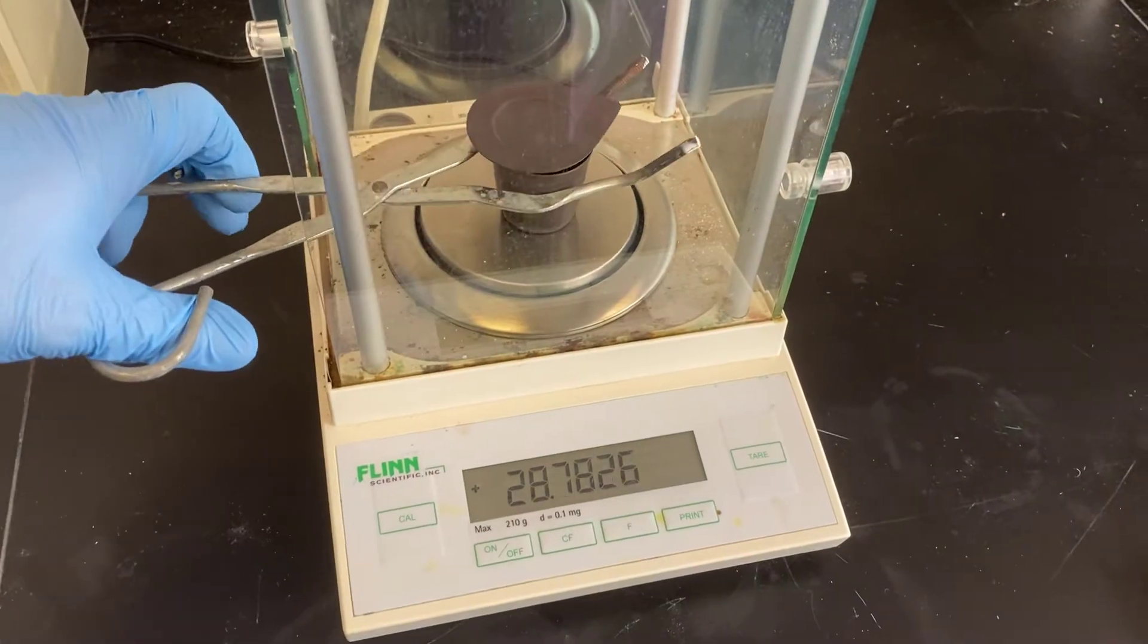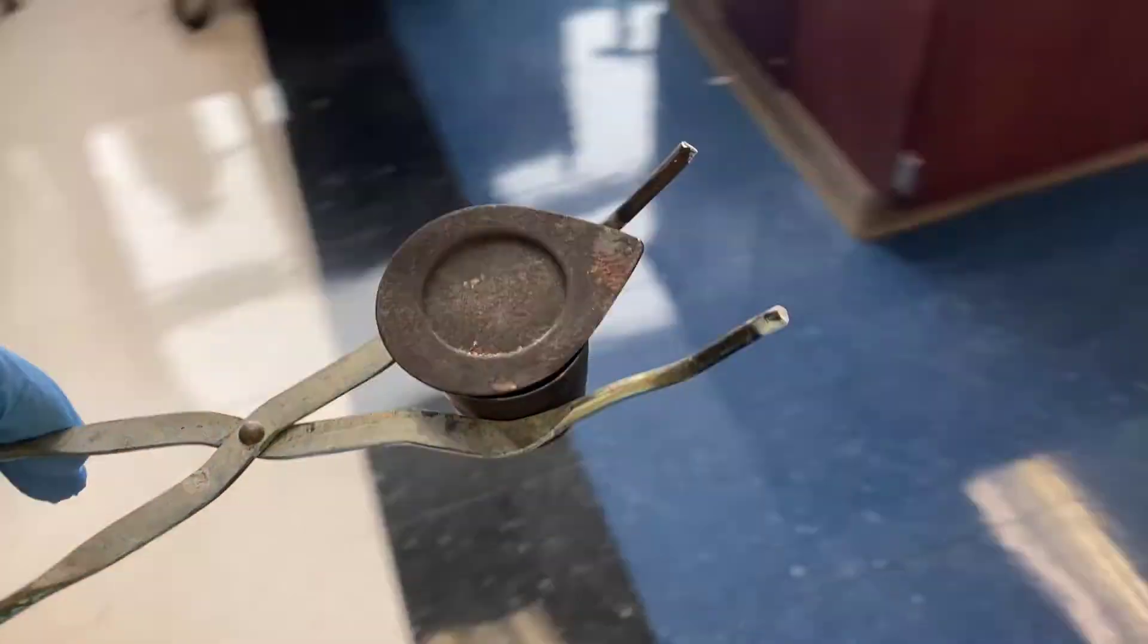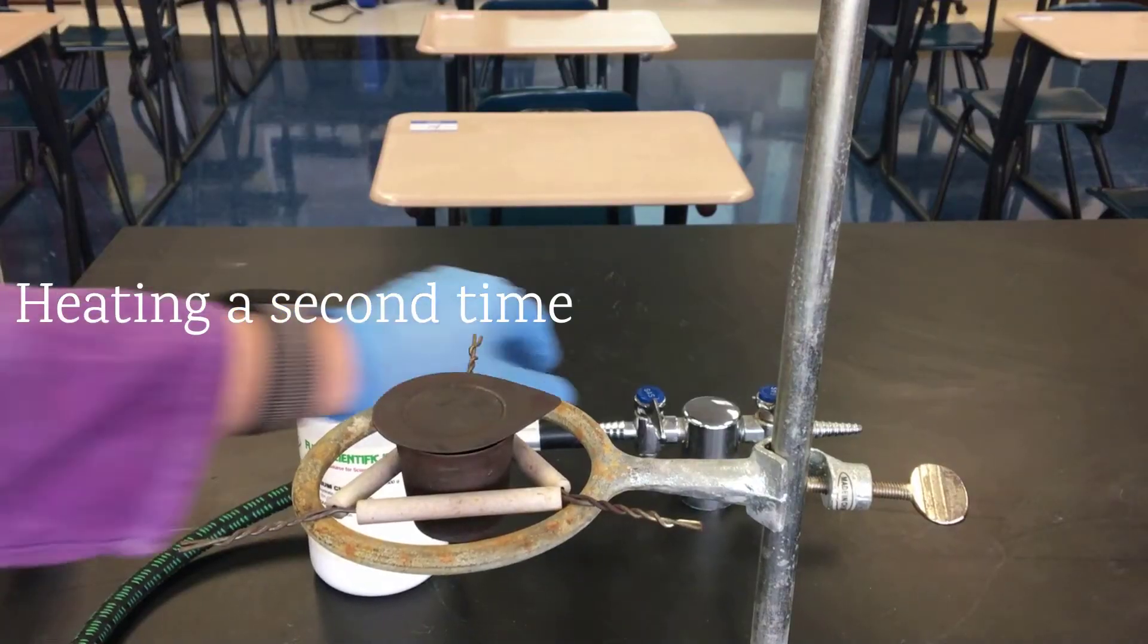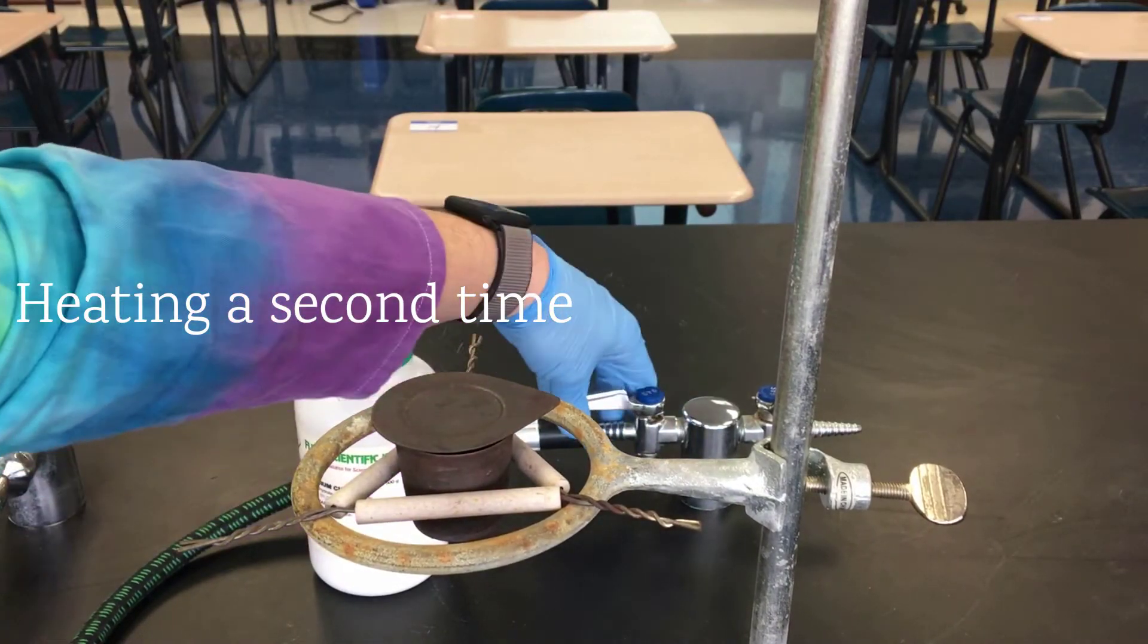We'll go ahead and take it back to our apparatus, to our clay triangle and our ring stand. We'll go ahead and heat it a second time. Again, we're going to heat it for about five minutes.